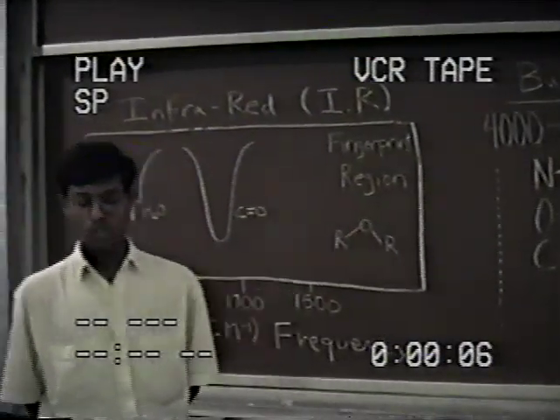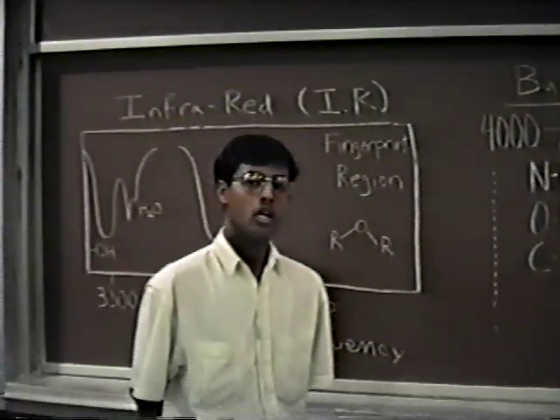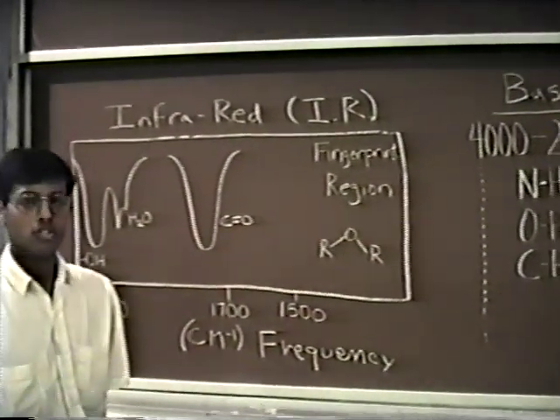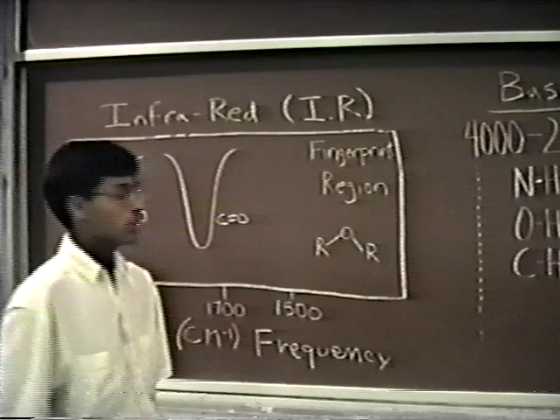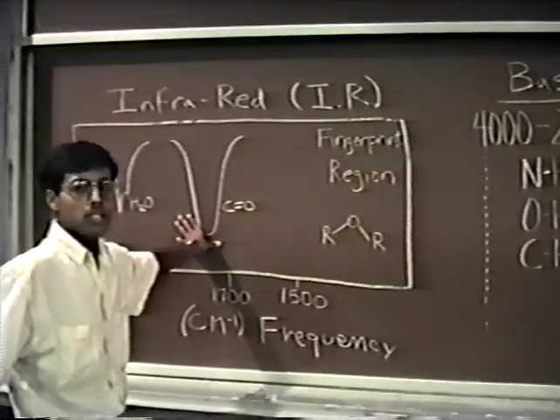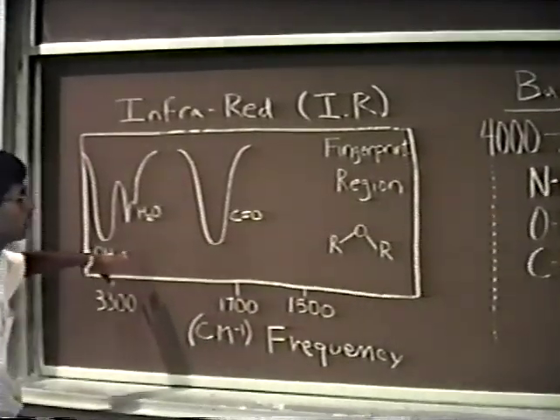This week's lab, we're discussing molecular spectroscopy: IR (infrared) and NMR (nuclear magnetic resonance) spectroscopy. First, I will discuss IR with you. What you see here is a basic IR spectrum.